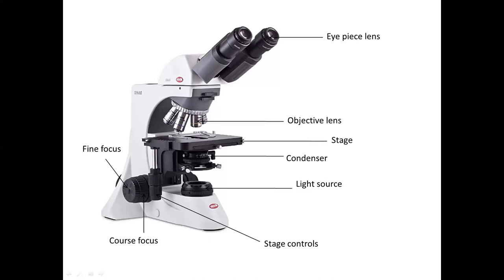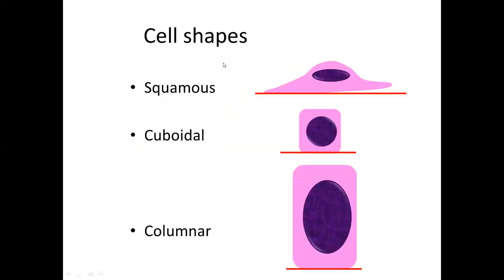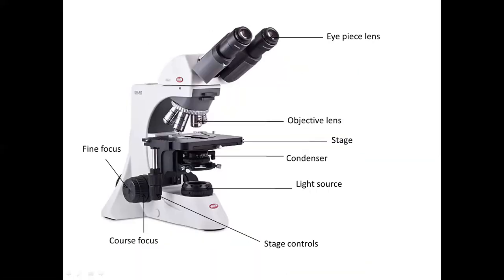The nosepiece is the area which you can move. Attached to it are the objective lenses. In this particular microscope, there are four objective lenses, and you can see the bands of color that tell you the magnification size. The lowest magnification is 4, the yellow band is magnification 10, and the blue band is magnification 40.